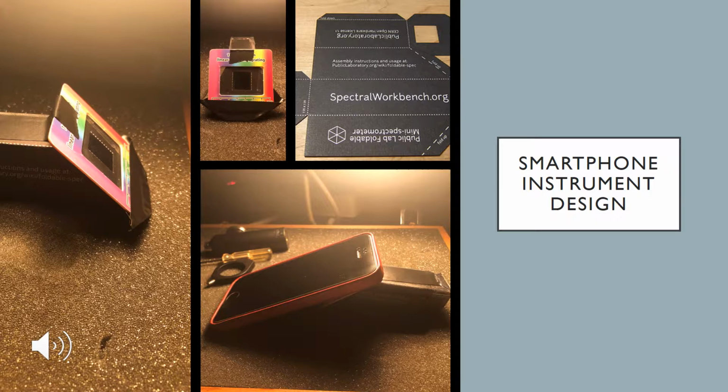The electrical tape helped block out any surrounding light and provide us with proper spectra, and the surrounding of the spectrometer itself was taped with electrical tape in order to prevent any light leakage. The spectrometer was then taped to the camera of an iPhone 5S to use as a final spectrometer and iPhone setup.